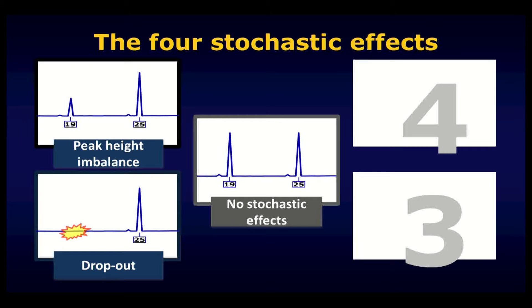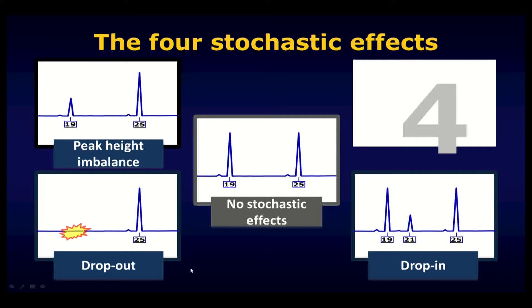A third kind of stochastic effect that commonly occurs is the reciprocal of dropout — and that is allelic drop-in. In this electropherogram, the 19 and the 25 have been detected as expected, but in addition to that, a third allele — here a 21 that wasn't part of the original sample — is also being detected. Many crime laboratories would call an allele like this 21 contamination. It may have come from an analyst, or from reagents or plastic ware used in testing. What makes it drop-in is that it wasn't actually part of the sample collected at the crime scene, yet it appears in the electropherogram as if it may well have been.